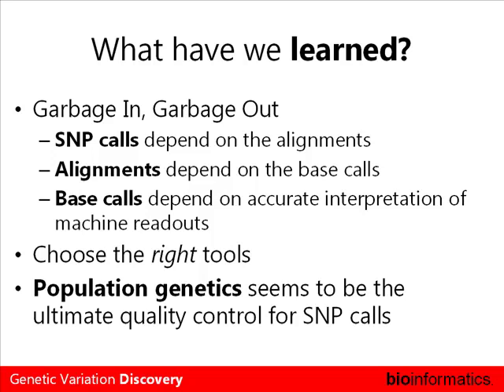So you want to get the truest calls possible. Another one is choose the right tools. And by that, I don't mean use our tools. I mean, for whatever problem you have, try and figure out what's the proper tool. Don't do this in a sort of lazy approach where you hear everyone's using this one tool, so you might as well do it too. It pays off to spend maybe a couple of days researching the tools and figure out, okay, which one will actually deliver on what you're trying to accomplish.